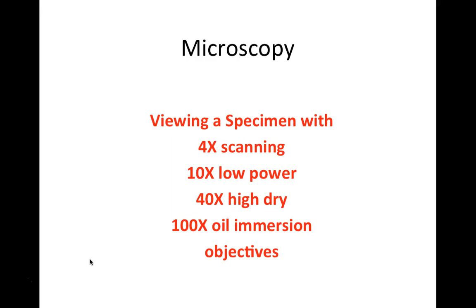These are all the objectives that are traditionally used in teaching microscopes in undergraduate biology laboratories.